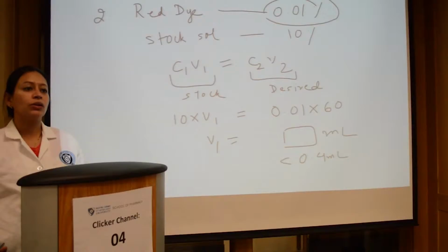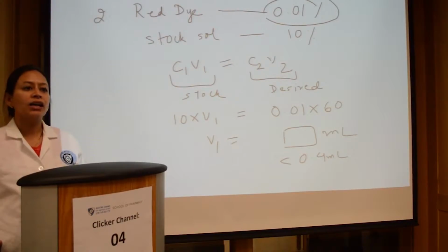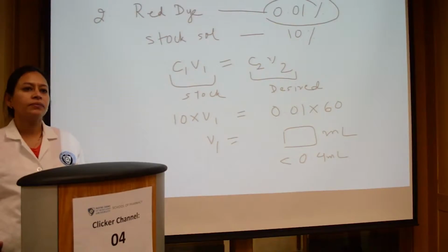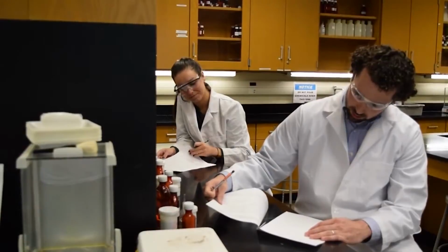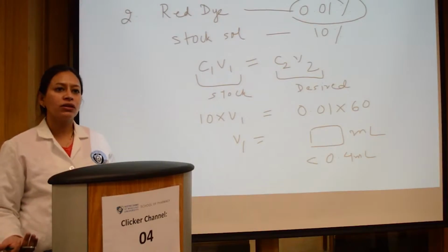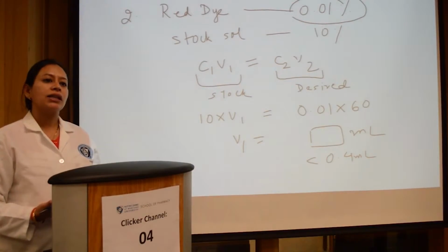Similarly, you will just do the calculations for the rest of the ingredients that you have in your prescription. Okay, so you have sucrose, because obviously sucrose is required for providing the sweetness. Okay, and the dye gives you the color. Okay, what is the flavoring agent in this preparation? Vanillin, right? So vanillin is the flavor, and then is there anything else that you have in the preparation? Water. So water is used as the vehicle because it's an aqueous preparation, so you need water to dissolve the sucrose, right?